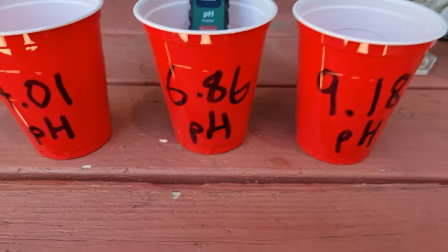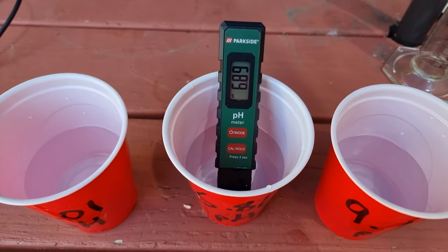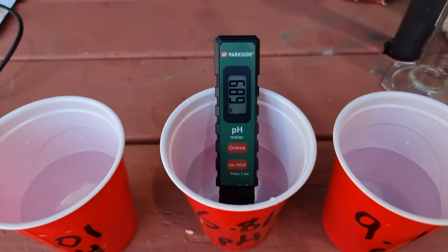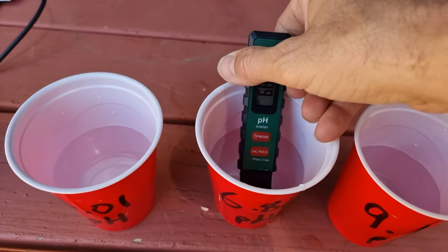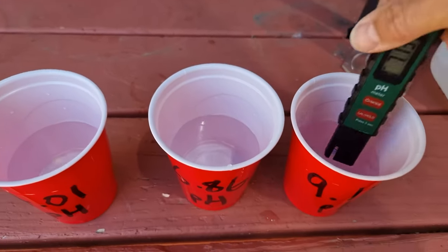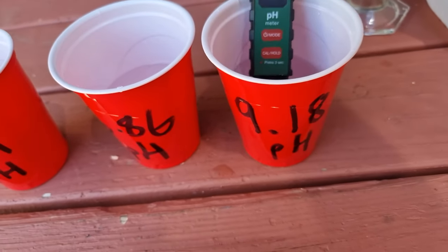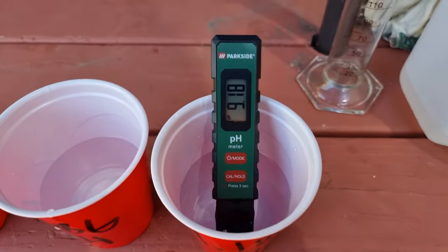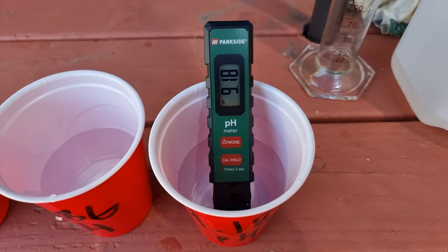That was not easy, but I finally got it calibrated. The instructions were nigh on useless. But here you can see it's in the pH 6.86 buffer solution and it's reading 6.89 — which is good enough for government work. And in the 9.18 buffer, letting that sit there for a bit of time, we can see 9.18 — bang on.